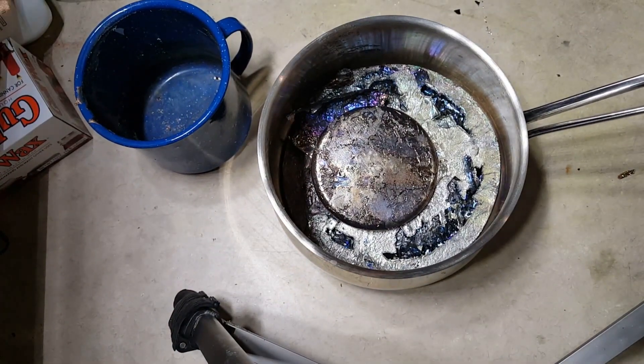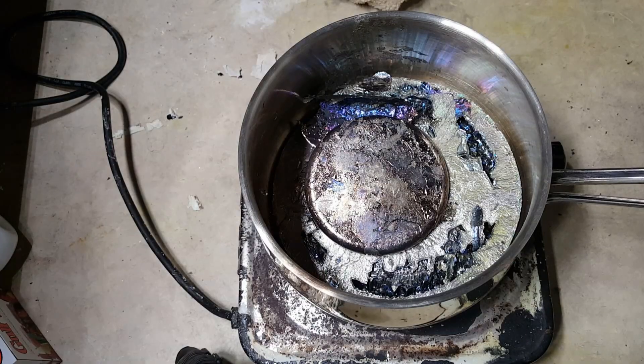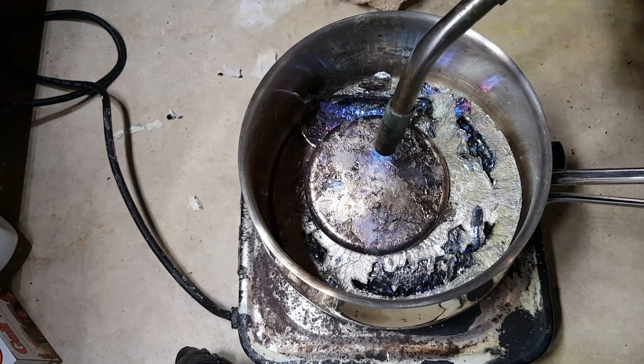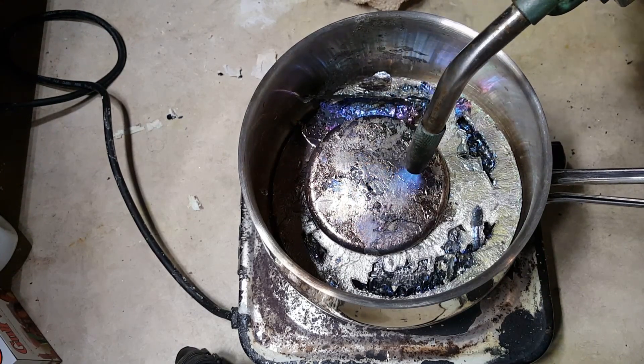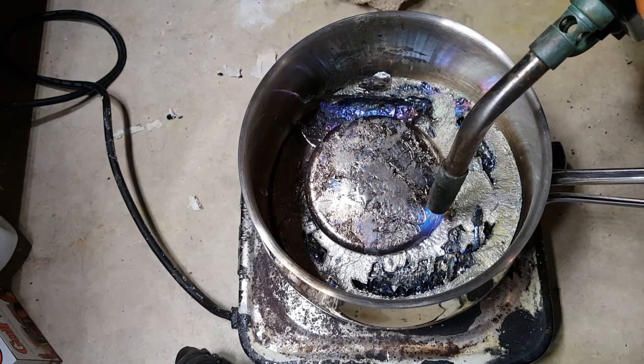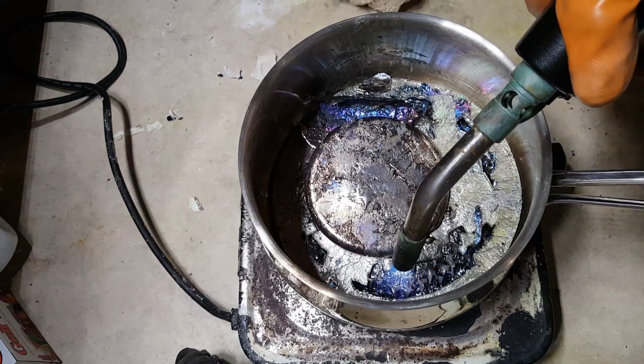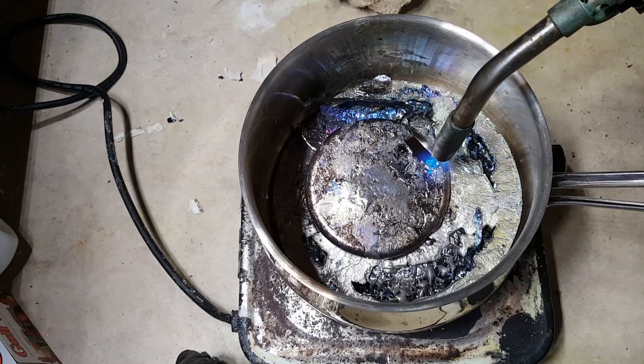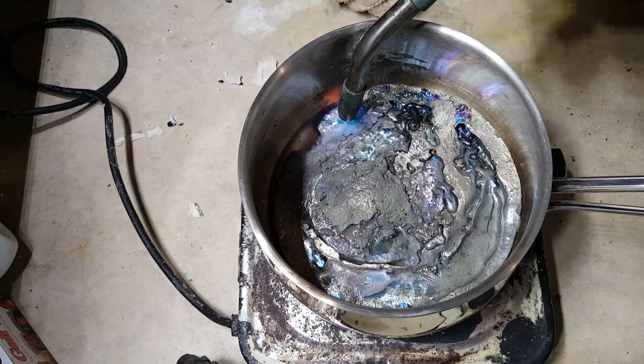I'm going to put this on a hot plate and start melting it. The rainbow color you see on the crystals — on the solid bismuth right here — that's bismuth oxide. It tends to form different colored oxides depending on the temperature when it touched the surrounding oxygen. I'm going to start melting this and speed it up with the propane torch.